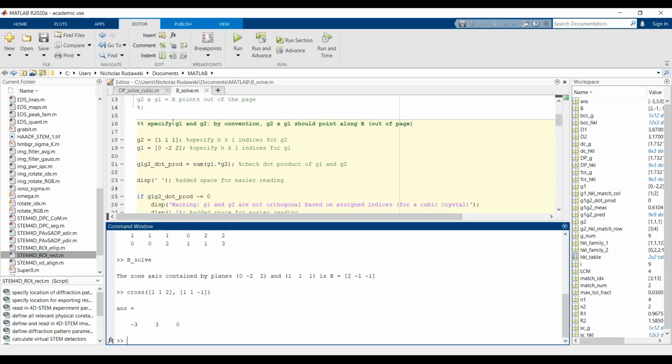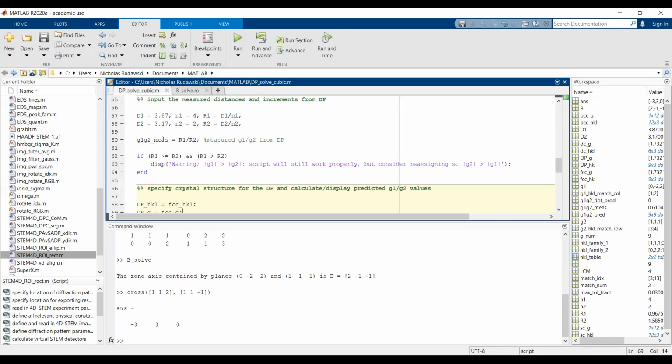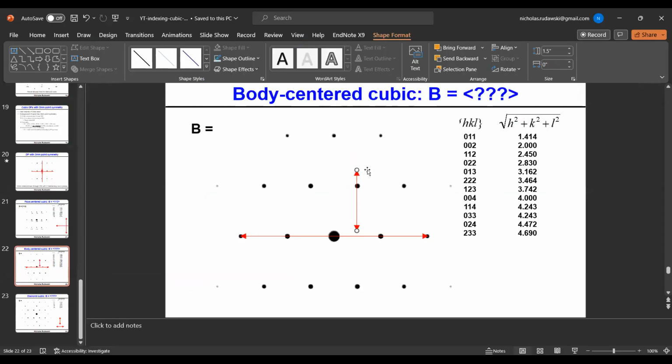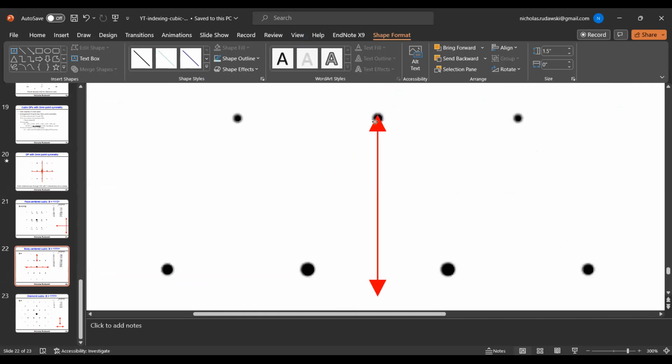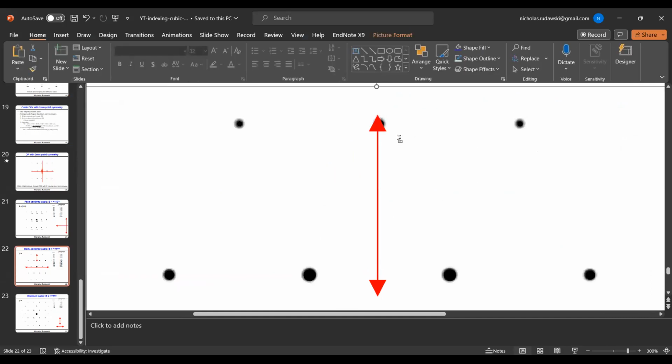These things are always right in the way. And I have 4 divisions. And then for this one, I only have 2 divisions.